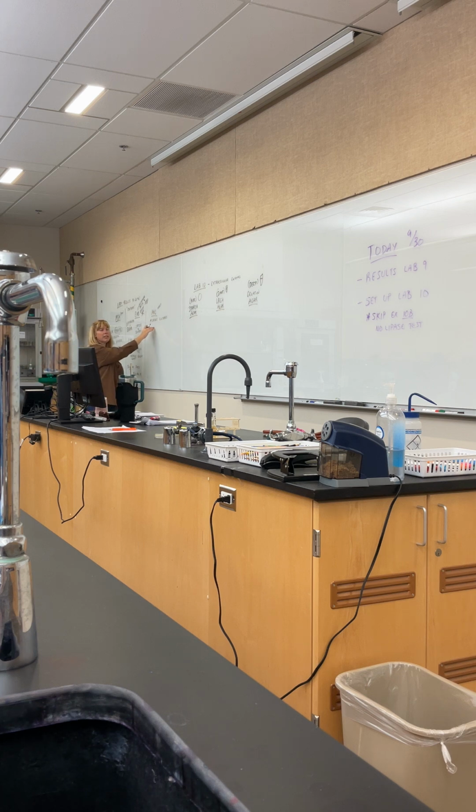If somebody has a UTI, we are always going to set up a urine sample on MacConkey. It's one of our cornerstones, kind of like how we always do a gram stain. Put a drop of urine, spread it out. The reason for that is that, and you don't have to remember this, about 95% of UTIs are E. coli caused. That's a pretty high number. So the majority of our UTIs are E. coli. We do have a few oddballs, but for the majority.